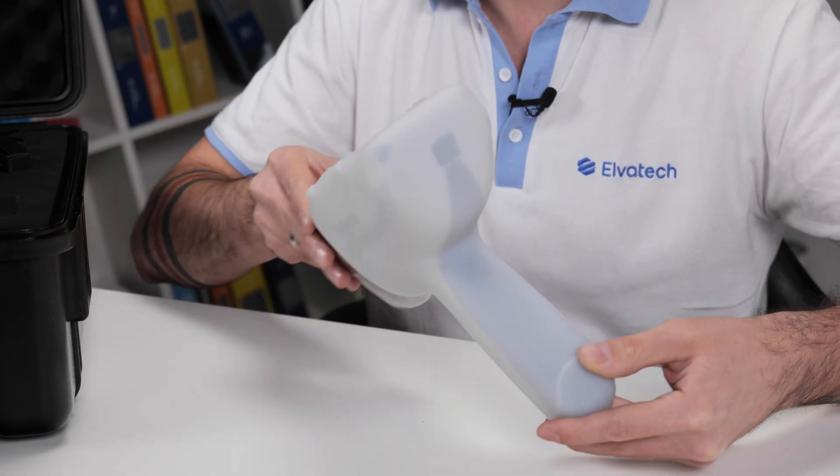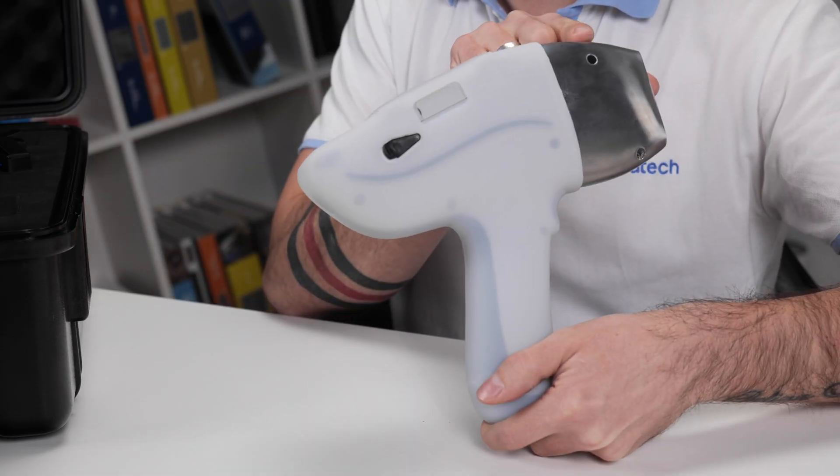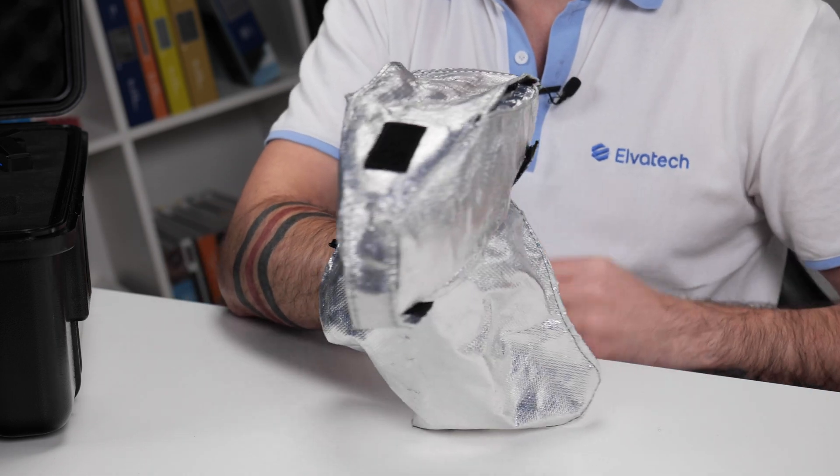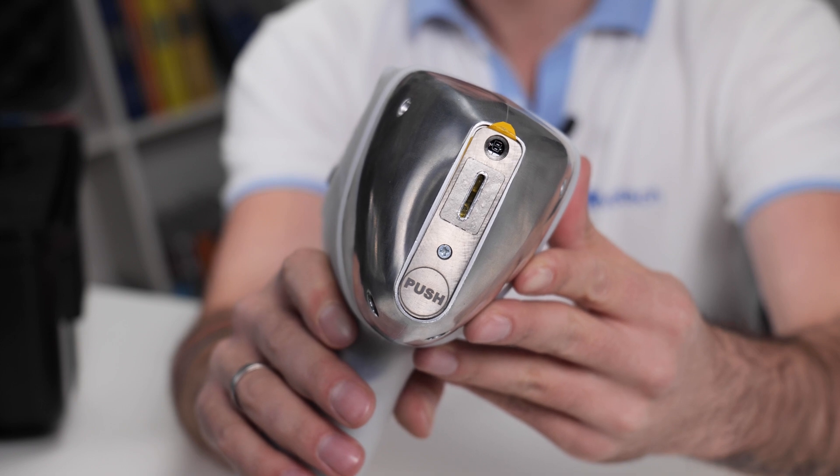The Prospector 2 also has additional options to help you expand its functionality. You can add a holster for easy carrying, a silicon case that increases IP protection, a protective case for analyzing hot samples, and a weld analysis nozzle for accurate weld analysis.